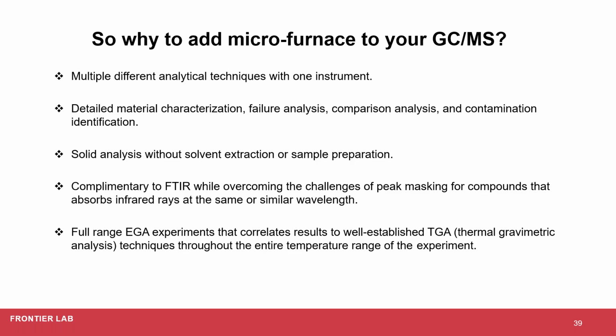And before ending my talk, I'd also like to mention, because I used to use FTIR and TGA in my previous role in conjunction with PyGCMS, that this technique is really complementary to FTIR. As an analytical chemist, every tool has its own advantage, and every tool in your toolbox can give you answers. PyGCMS provides a lot more detailed information on chemical composition when complementing IR. Also, pyrolysis can overcome the challenges of peak masking for compounds that absorb infrared rays at the same or similar wavelength.